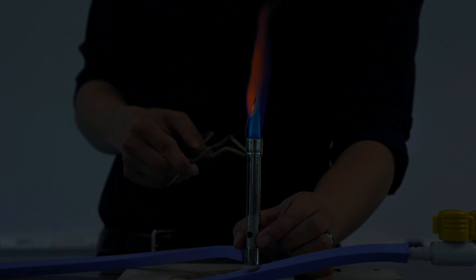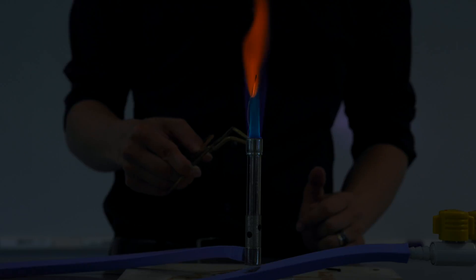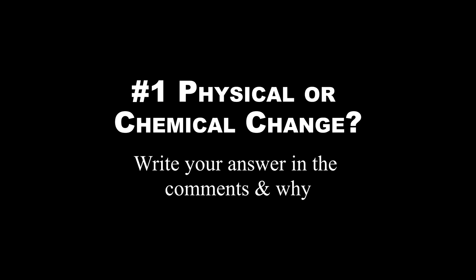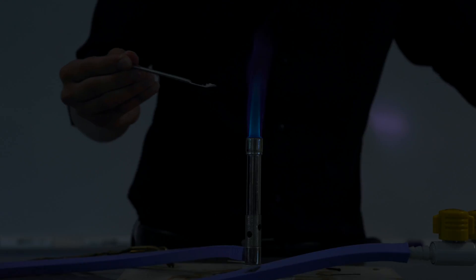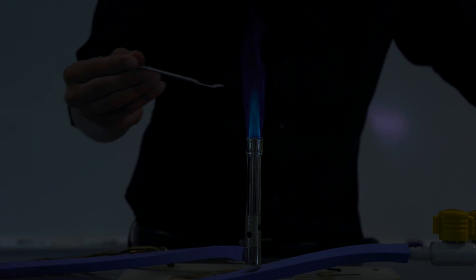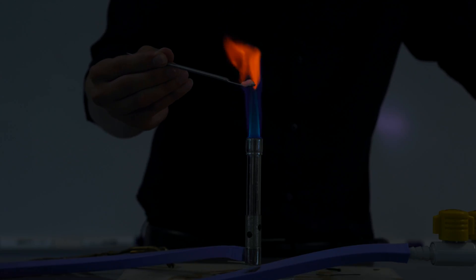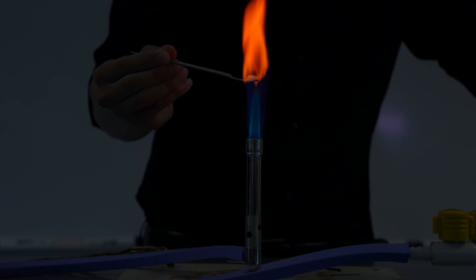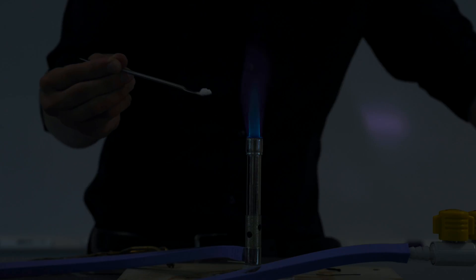It's not hot enough — it's like a steel sword. I'm adjusting the flame to get the best result. It gets better — it's changing color to orange. Now calcium goes an orange-yellow color. Color change? Yes, you can definitely see a color change. It starts off as a white powder, and as I continue — can you see how it's still a white powder?